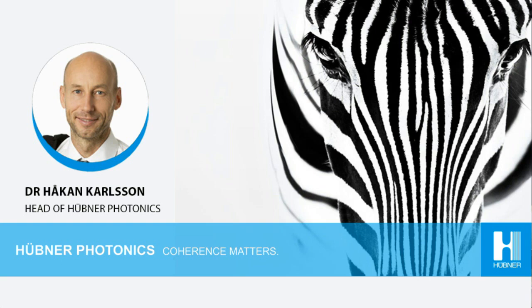They still operate in a narrow line width condition, and that comes from the fact that the longitudinal modes in a diode laser are very dense, which means that even if it's not locked on one longitudinal mode, it would still be narrow line width, and it would still operate in a stable way.